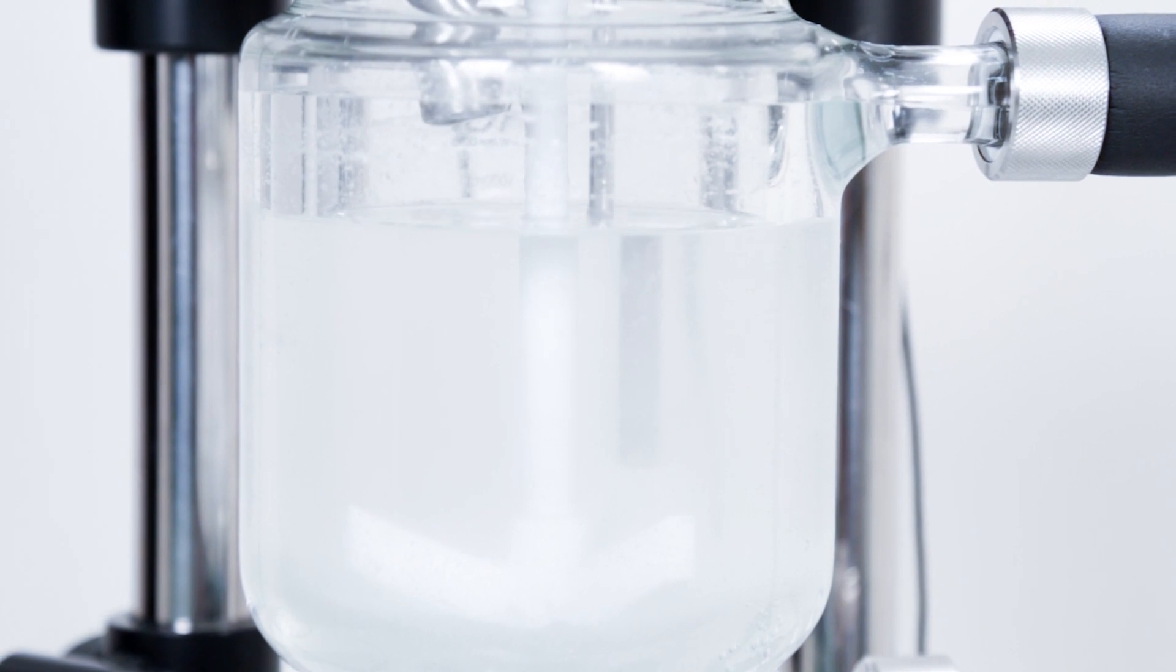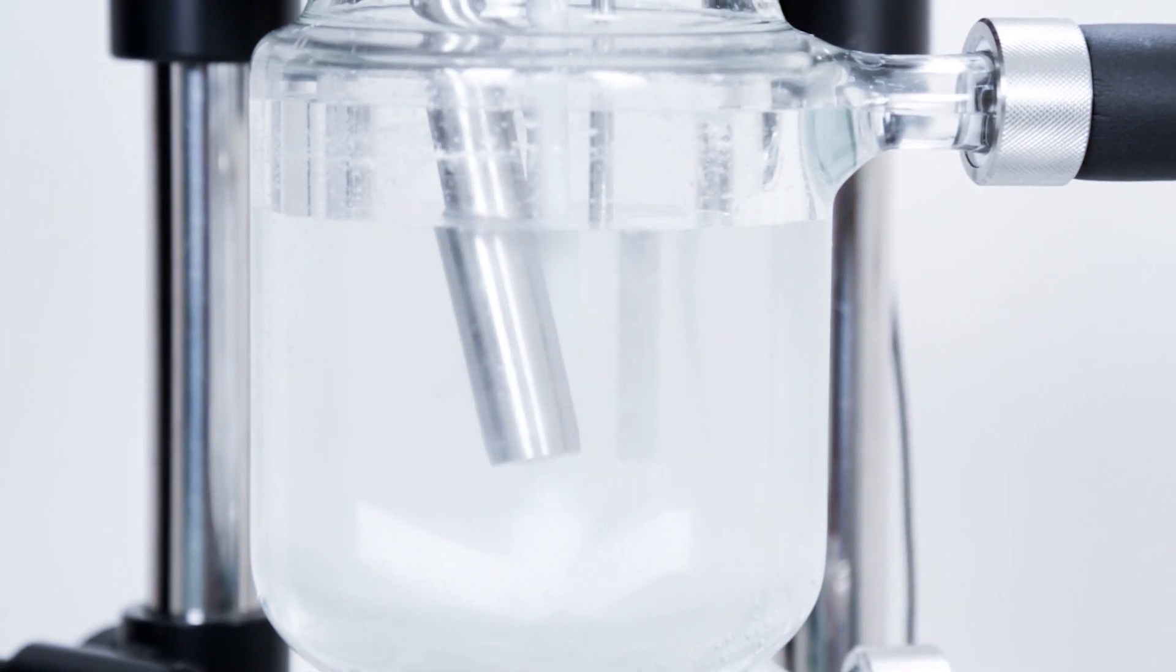the choice of probes enables confident scale-up from 10 milliliters to pilot scale.